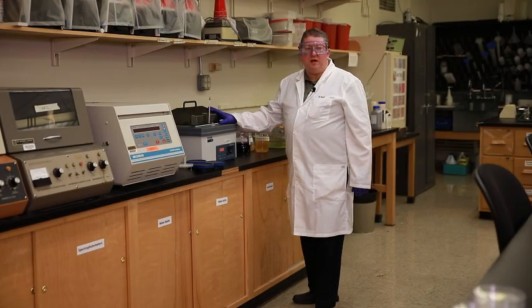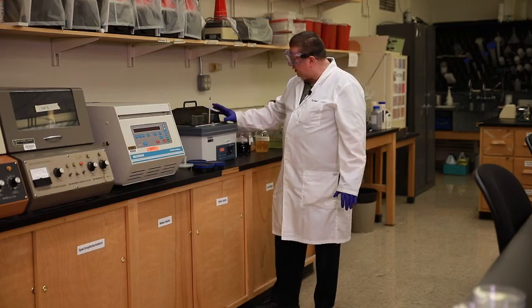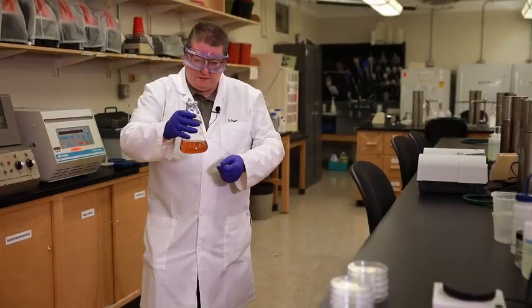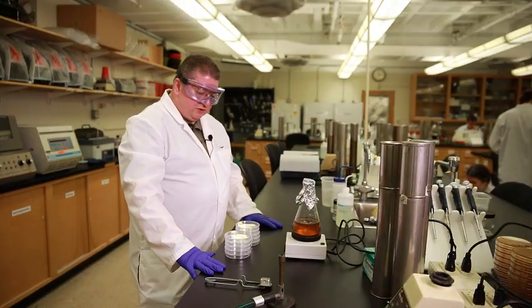One hour later. All right, so our flask has come out of the autoclave. We put it in this 60°C water bath for it to cool down. It is now ready to pour. So I'm just going to bring this over here. So this just needs a minute or so just to stir.